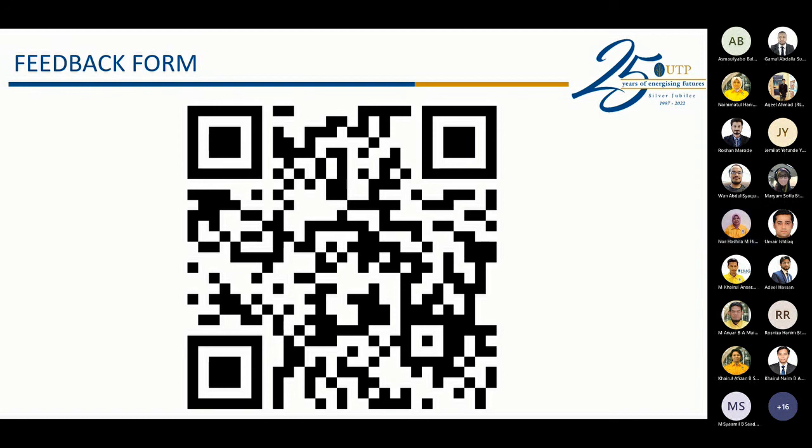In the solid material, the crystal structure is properly aligned, so it will give constructive peaks, and the peak intensity will be higher compared to the powder sample. The powder has a similar crystal structure, but the direction will be different, so the peak gets broader.